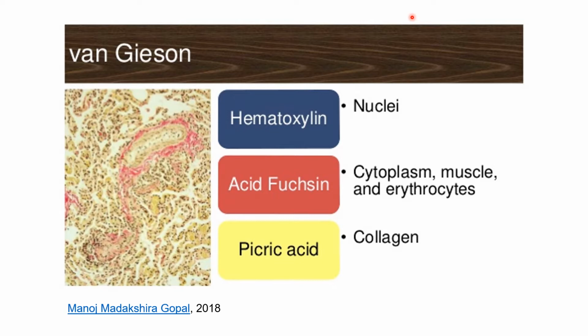So again, as I told you, viewing cells with a standard light microscope is so difficult. That's why it's essential to use stain for contrast. Once stained, we could identify the cell morphology, size, and of course the arrangement.